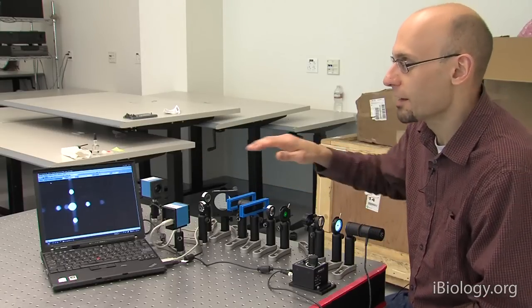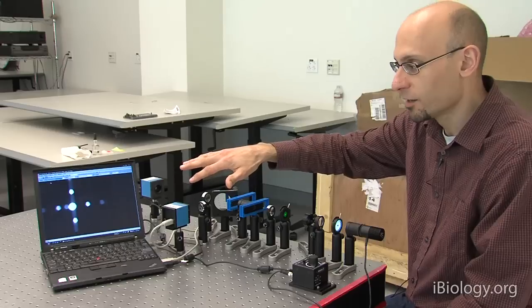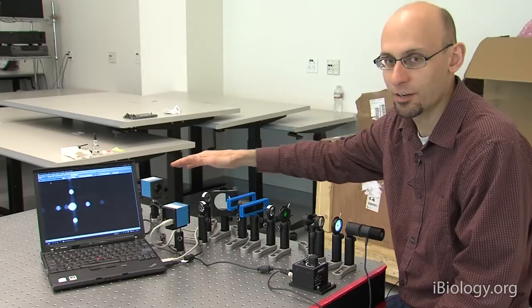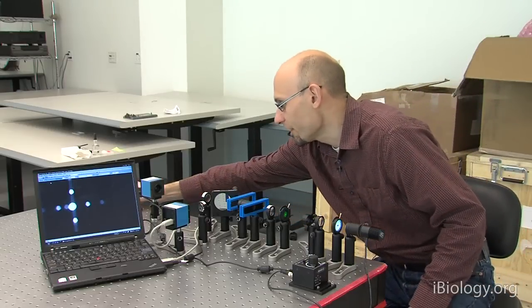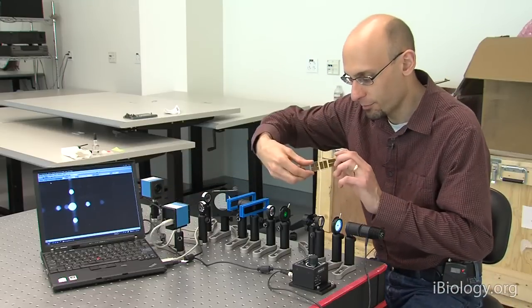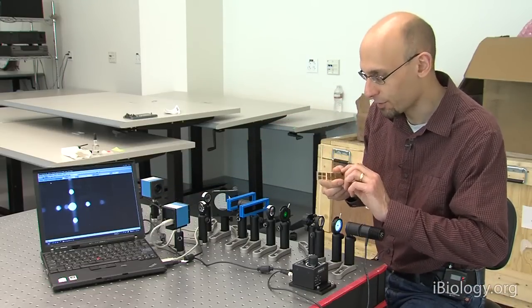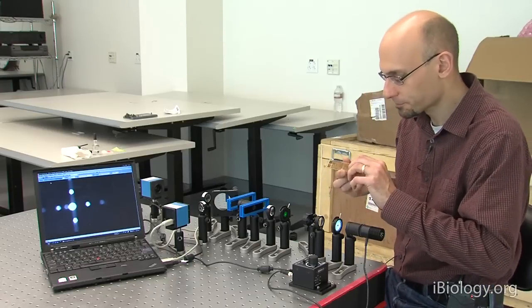And furthermore, if we manipulate what makes it through the back focal plane by blocking some of this light, we will change what we see in the image plane at our image camera here, because we've removed that information from our image. And so to do that, we have a set of patterns here. These are just similar metal masks that we can position in the back focal plane to prevent this information from making it to the camera.